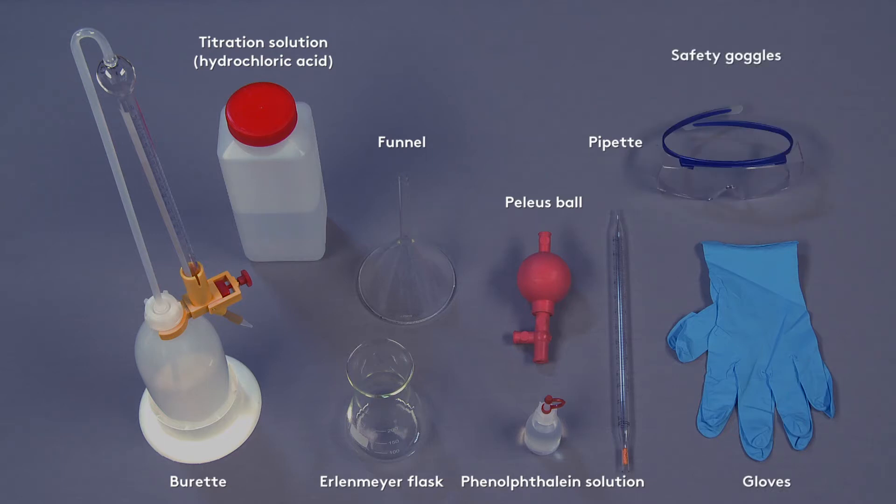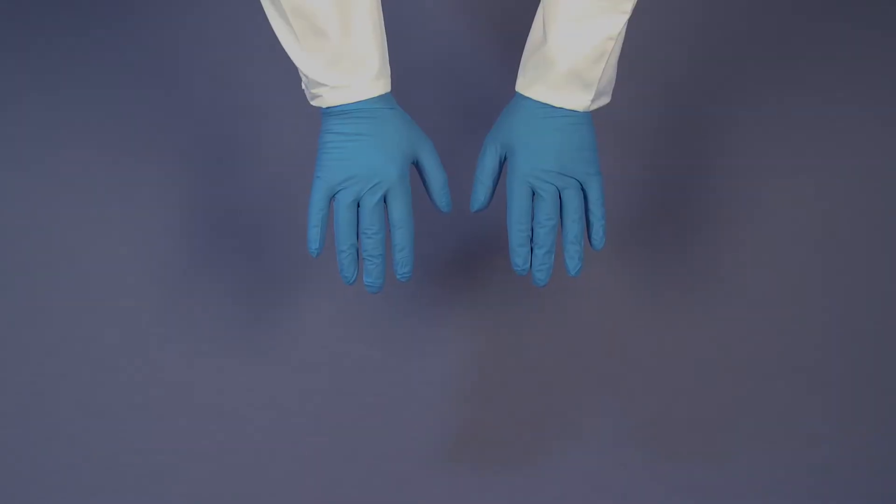This video will show you how to correctly determine the concentration level of a cleaner using the indicator phenolphthalein. Attention! Wear suitable protective clothing before you start.